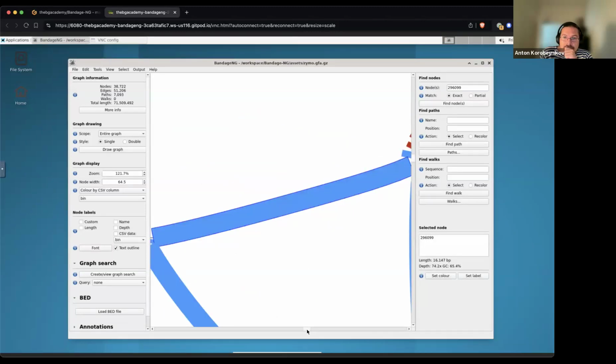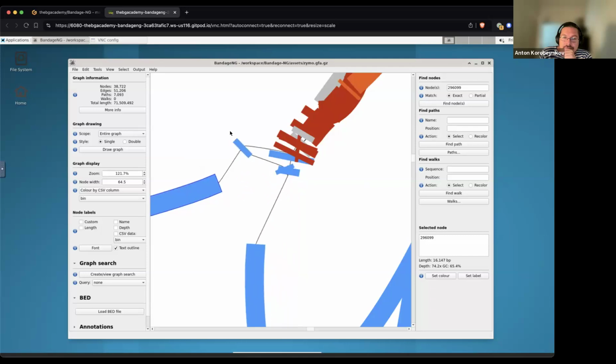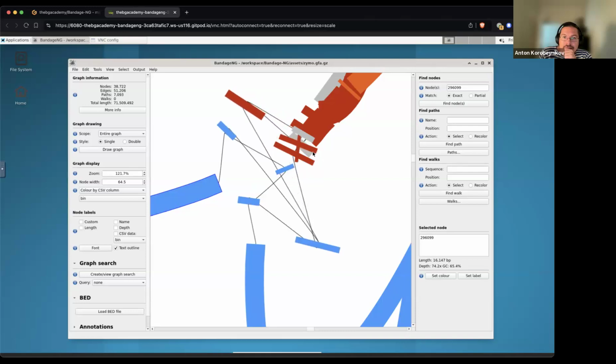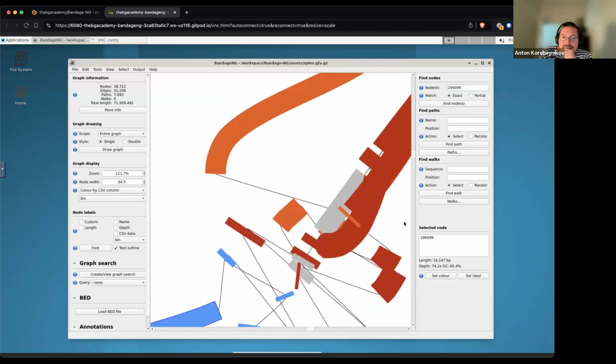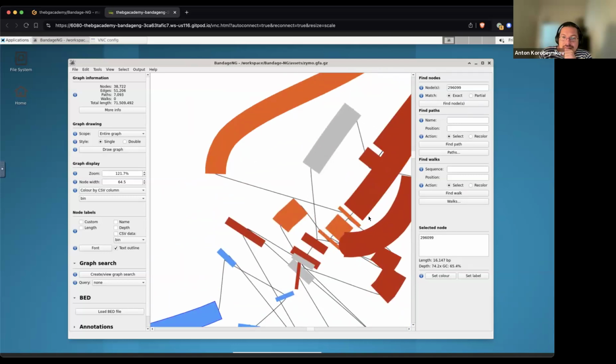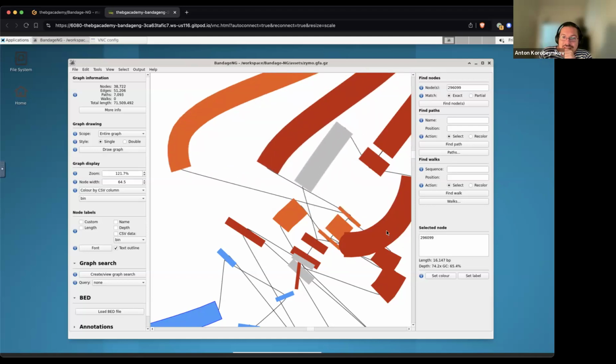So this is the node, but it connects to the other nodes out here. You could see, right? There are even multiple bins, so it's definitely a place where multiple bins collide, right? So we can even check what's going on.